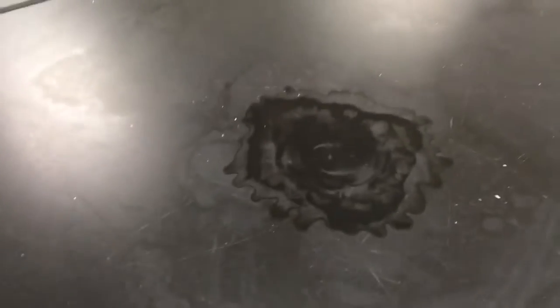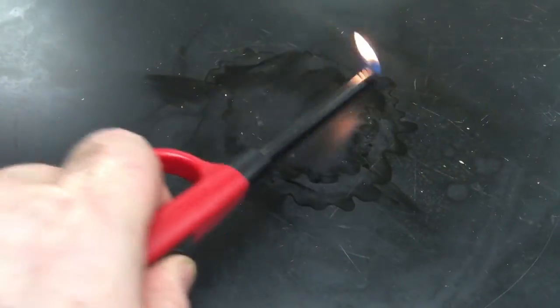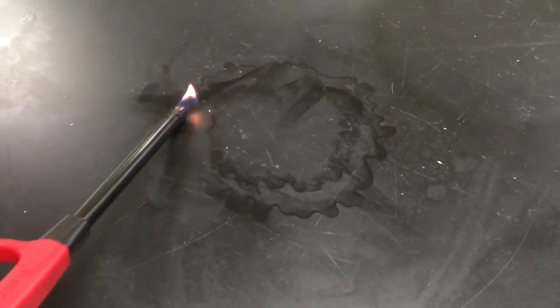Now that the reaction is done, there's no more fire. Notice there is some stuff left behind on the table. It smears around. It's liquid, but that liquidy stuff isn't flammable liquid, it just got left behind. So make sure you make a note about seeing that liquid left behind on the table, and if you write your reaction out, you might also be able to figure out and tell me what that liquid is that's left behind on our table.